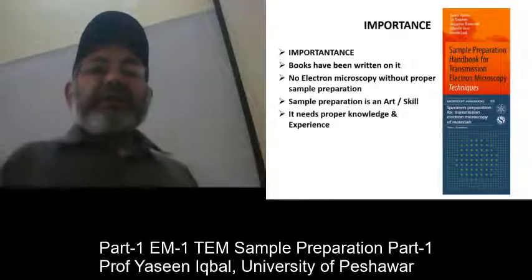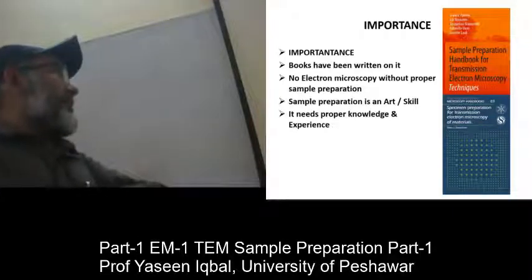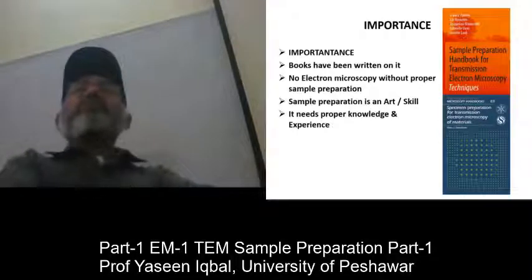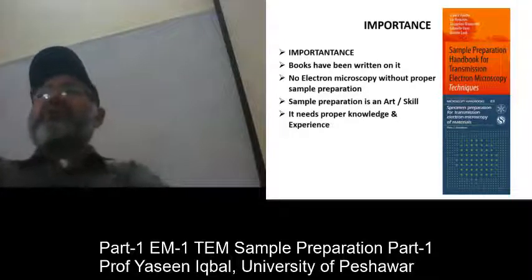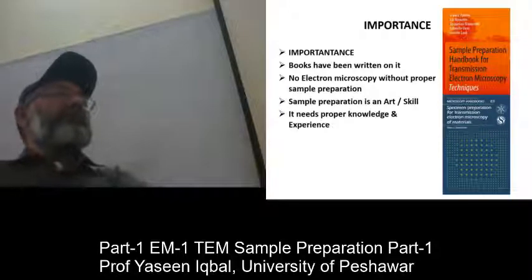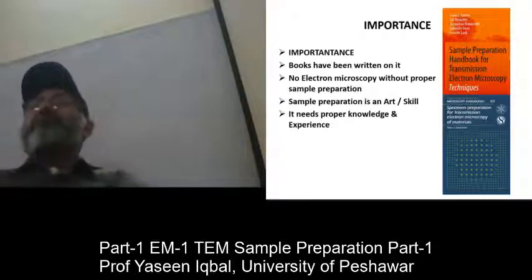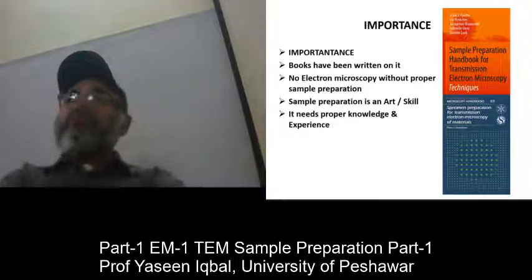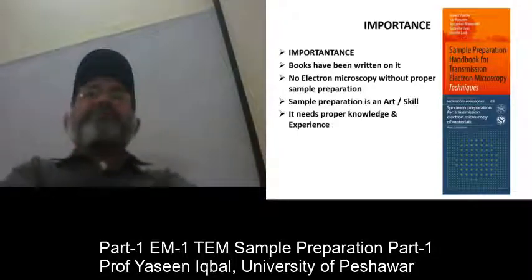The TEM sample preparation, its importance is that books have been written on it. Because when you achieved very high magnification using the electron wavelength and enhanced the resolution of the viewing devices or instruments and machines, the first problem was how to make an electron transparent sample.